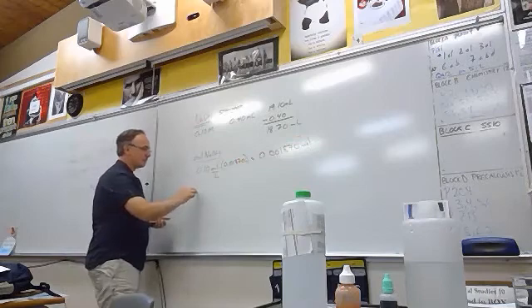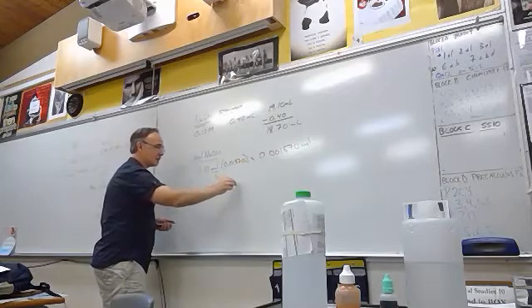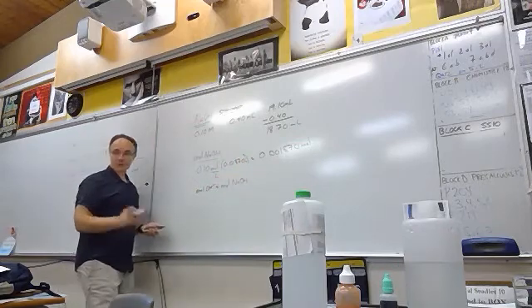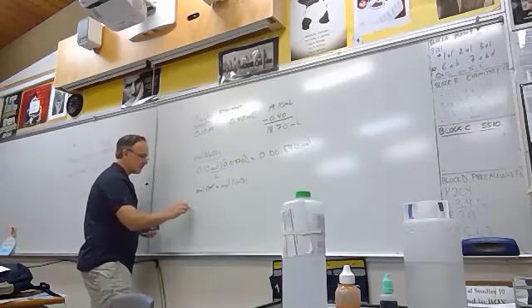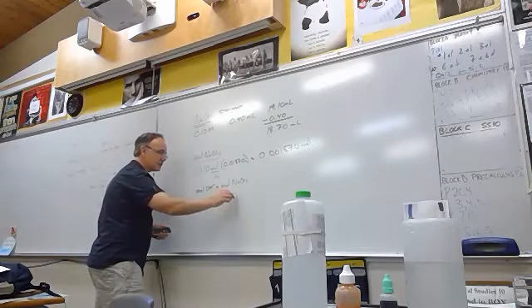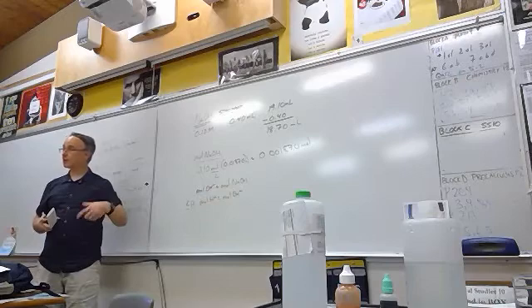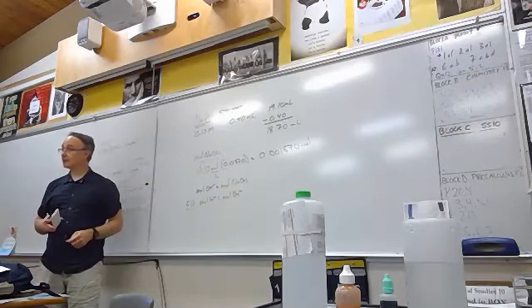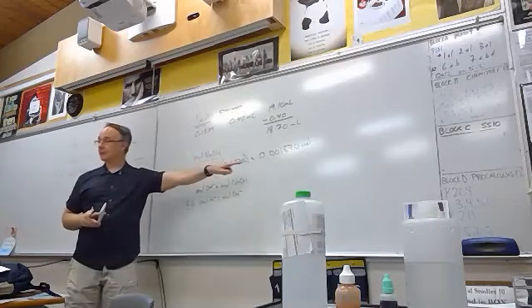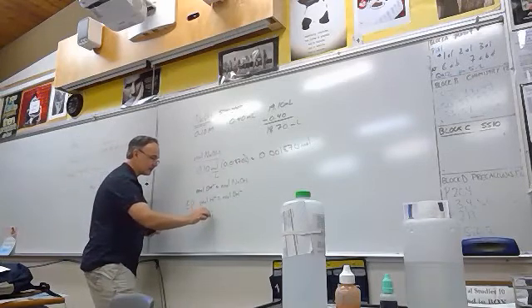And of course, the moles of OH minus will equal the moles of the NaOH, because for every one NaOH, there's one OH group that we can use. Because we knew we reached the equivalence point, we can say the moles of H plus will equal the moles of OH minus. That's the definition of equivalence. We know we reached it because the phenolphthalein turned that color. So basically, the moles of H plus, the moles of OH minus, and the moles of NaOH are really the same number here.